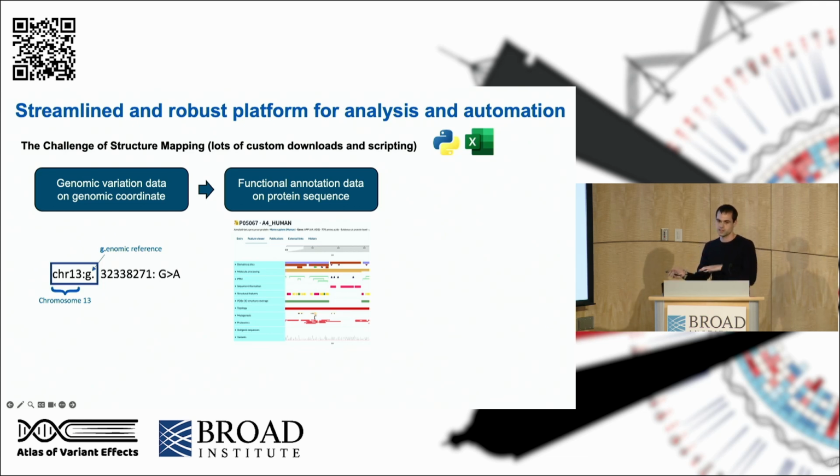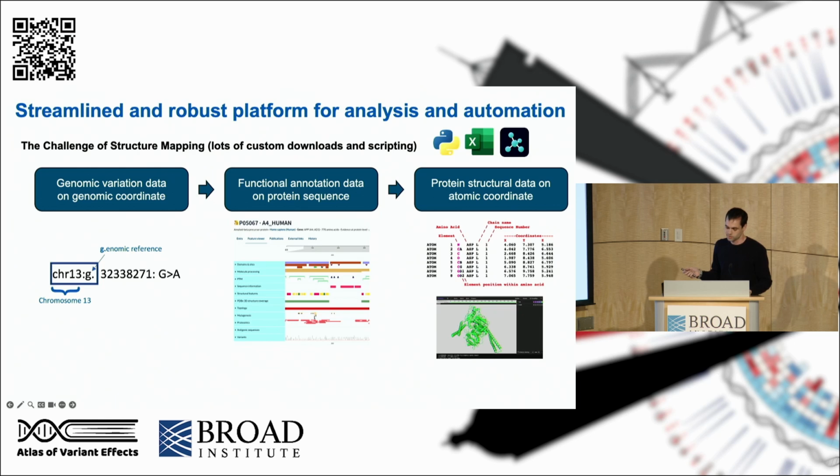Now you can write a workflow that will take your spreadsheets and visualize them on the sequence. You'll probably use Python or R or Excel. And then finally, you can go to your structure viewer of choice, for example, PyMol, and view the protein structure. The process is pretty time-consuming. We often find that it takes somewhere from a few days to a few weeks to get all of the data together, process it, and get it into the correct tools for mapping.